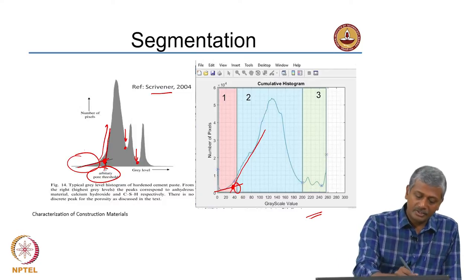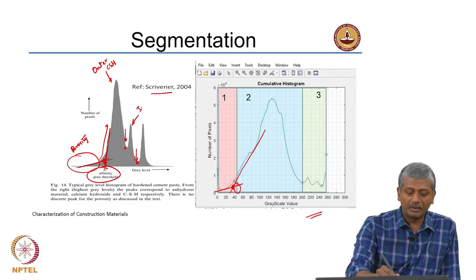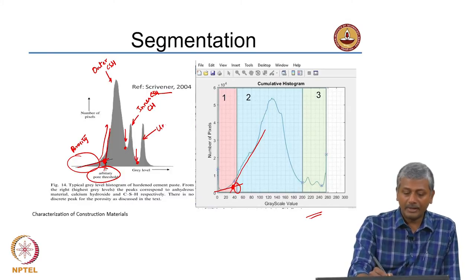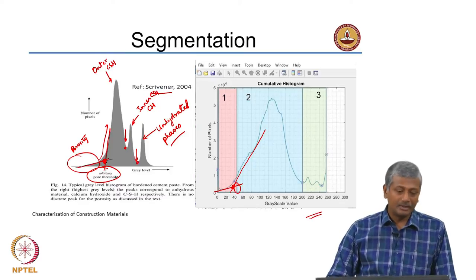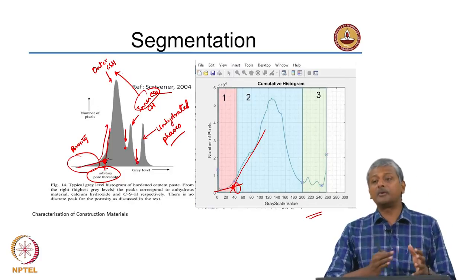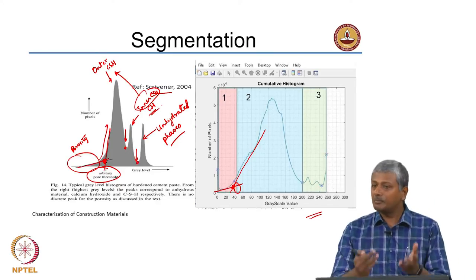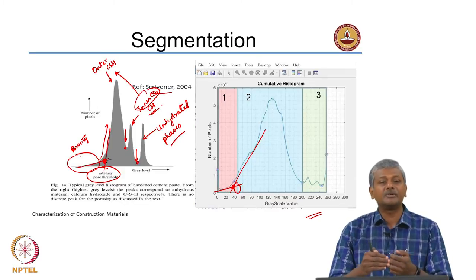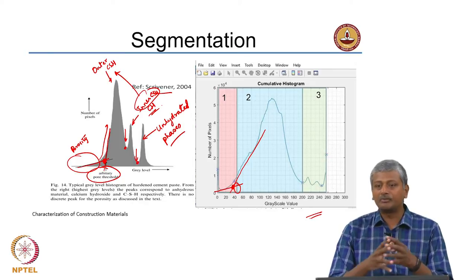What do you think these phases are? This region is porosity. This may be outer C-S-H. This could correspond to inner C-S-H or probably to calcium hydroxide, and that could be unhydrated phases. You will be lucky to get a histogram with such specific peaks for each phase. Usually your inner C-S-H and outer C-S-H will not be distinguished that clearly in terms of grey levels; calcium hydroxide may be, but not inner and outer C-S-H. Again, this depends on how well you have prepared your sample and how well you have set the imaging characteristics — brightness, contrast, focus, and stigmatism correction.